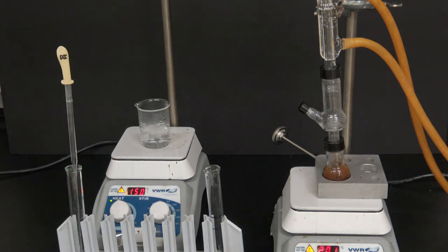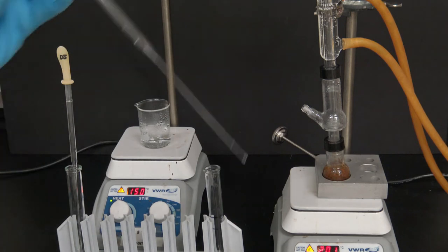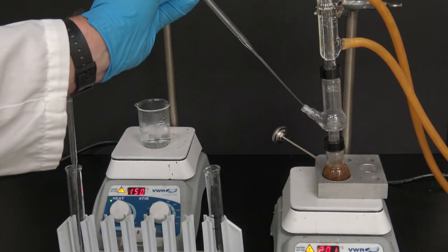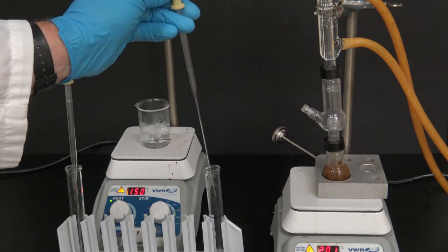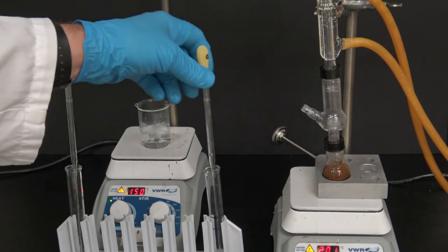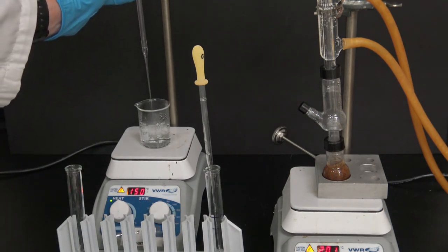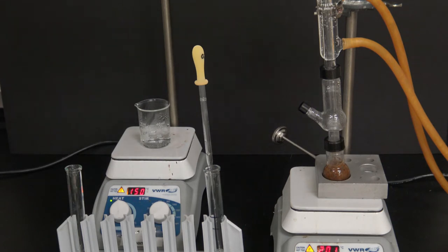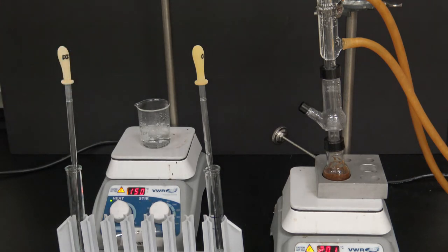I can now see that some liquid has collected in my Hickman still, so I'm going to attempt to remove that by taking off the cap of my sidearm flask, sticking in my pasteur pipette, and sure enough, there's some liquid. I'm going to put that in my conical test tube here. Now that I've done that, I'm also going to replace that volume of water using my DI water pasteur pipette, sticking it right down the center here and dripping it right down into my round bottom flask. And then we're going to wait again until I get more liquid collected from the vapors in my Hickman still.